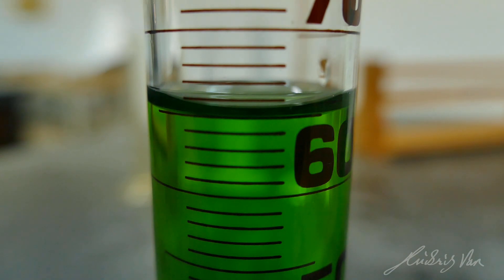So this is how you measure accurately with a measuring cylinder. But of course, it's not the most accurate measuring instrument. For a more accurate one, you probably want to use a syringe. But of course, given the volume — maybe 100 ml — you need a measuring cylinder.